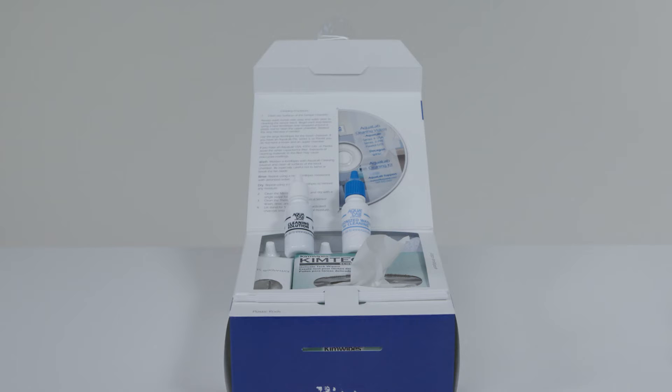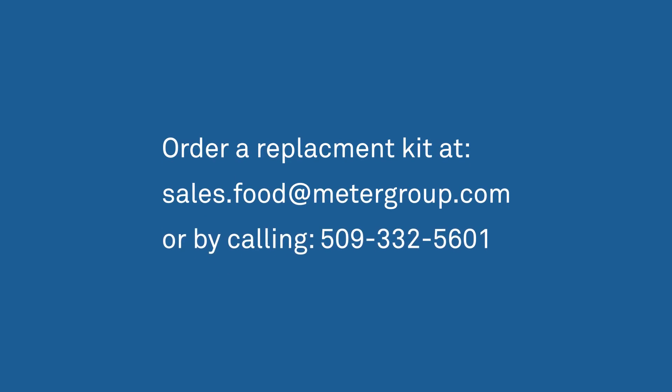To clean the instrument, use your Aqualab cleaning kit. One is included with your instrument. You will get a new kit after each annual calibration. Order a replacement kit at sales.food at metergroup.com or by calling 509-332-5601.